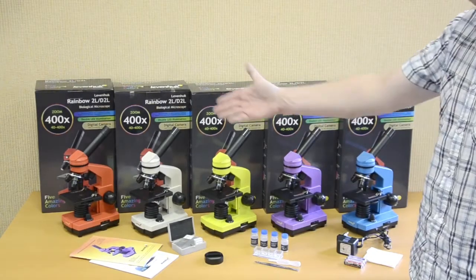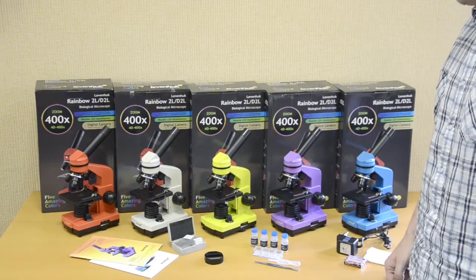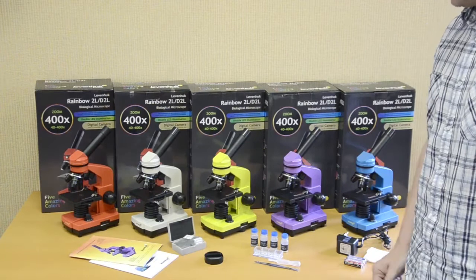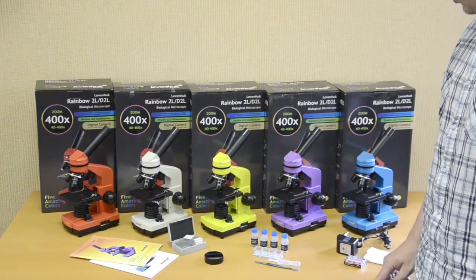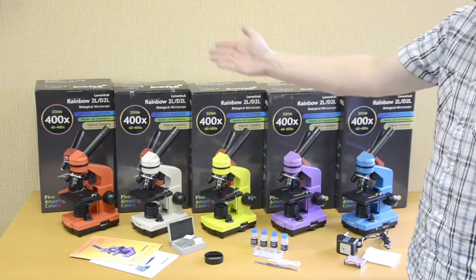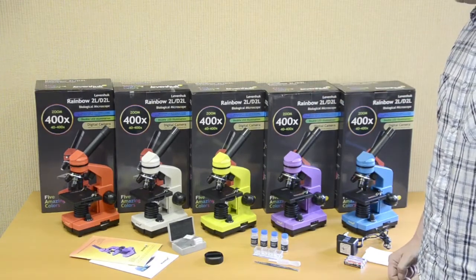The Levenhuk Rainbow 2L microscopes are available in 5 bright colors. Each color model comes with an experiment kit, prepared microscope slides, blank slides, user manual, AC adapter, batteries, and dust cover, all packed in an attractive, colorful gift box.